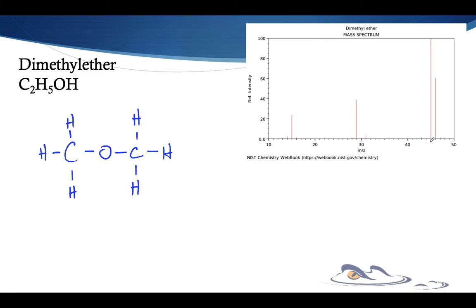Now, that's where I'm getting back to this mass spectra here. We can see over here, here's our most massive peak, right? And these look like they're ones. So that's 41, 2, 3, 4, 5, and 6. So you can see there's its mass again at 46. That's the molar mass. But now I have this really big peak at 45, right?